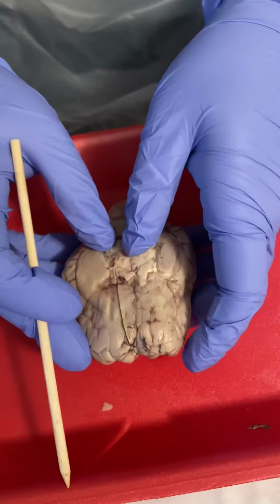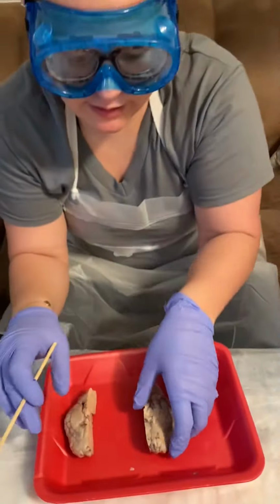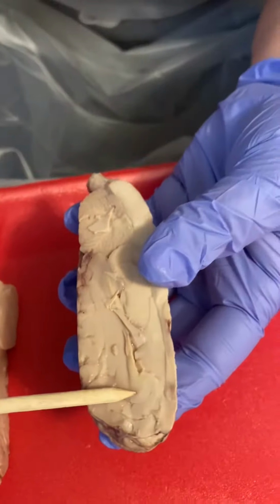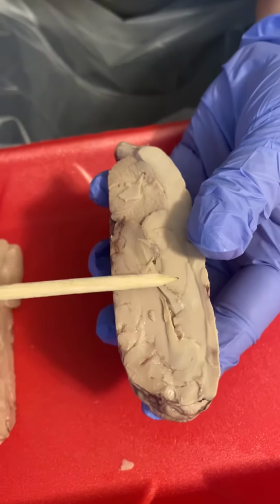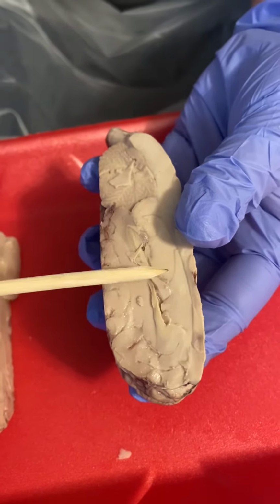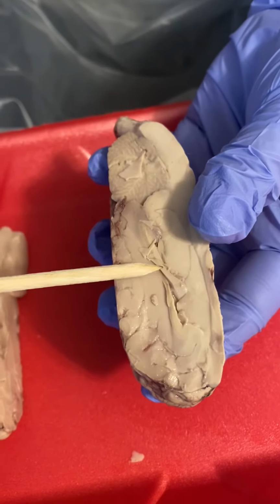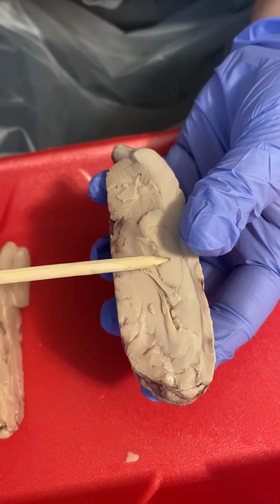So I've already pre-cut this. I'm going to open up. Here, this is your olfactory bulb, your olfactory tract. Your optic chiasm would be here. Your optic tract here. And then this would be your pituitary gland.